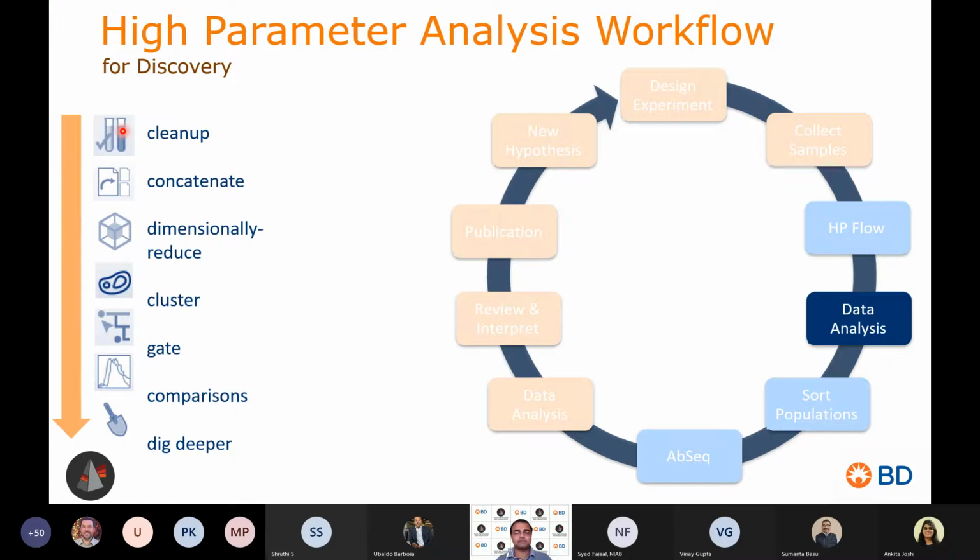I will first finish my deck and go through it, and then we'll take a short break and maybe a quiz, 2 or 3 questions. Then I will go to a live mode where I will show how to use a few of these plugins with some actual data. Then Tim is going to take it forward with some more advanced analysis on FlowJo.